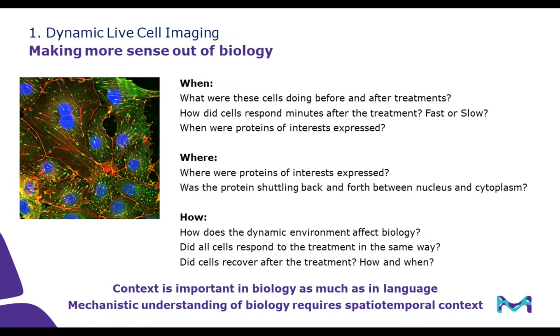So why do we want to do live cell imaging? There are tons of endpoint assays available in the market these days, and they surely give us some important data to understand how cells work. But more and more researchers don't find them sufficient enough to draw any conclusions because they don't see the full picture. For example, there's a cell right there at time 0 and still there 24 hours later. Does it mean the cells didn't move at all, or maybe it moved for a while and then moved back? Just because you didn't see it move didn't mean it didn't move at all, correct?